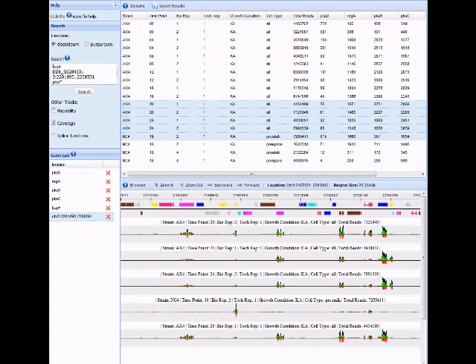Hopefully this tutorial outlined a few of the major features of this transcriptome browser, and it can be helpful for you as you explore the Dictyostelium transcriptome data. Thank you.